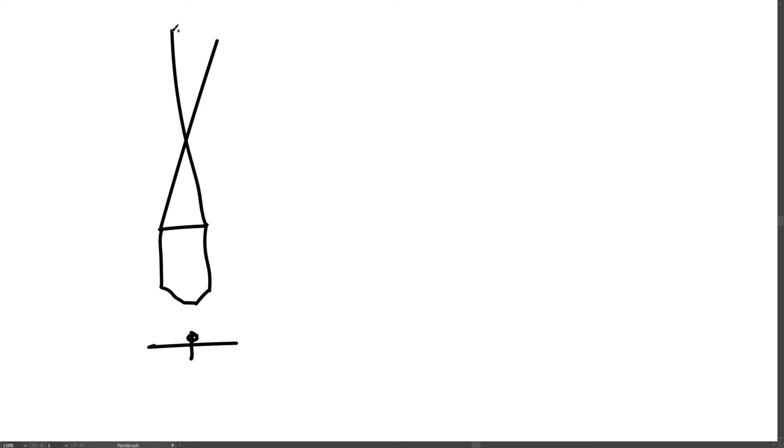Finally, I want to mention that there's two different types of microscope objectives. An older type, like a DIN objective, and the light, of course, comes through the sample and it's picked up by the microscope objective. But the lens is designed to bring the information through crossover.